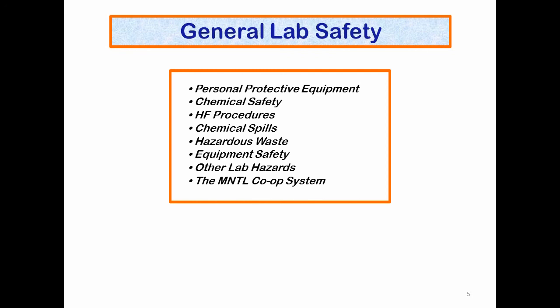You need to be aware of how to remove hazardous waste, specific safety issues involved with each of the equipment that you're using, general hazards in the lab, and always have a buddy when you're working after hours. You do this with two approaches, the co-op system and the buddy system.